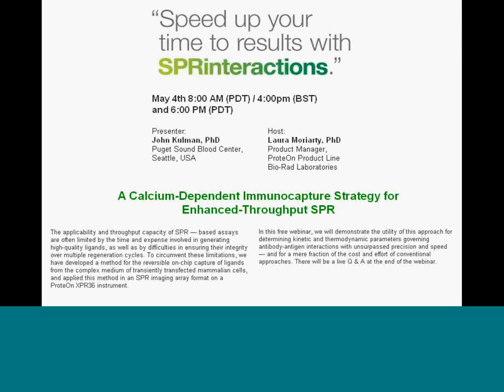So we're very excited to have John as part of our 2010 Become an SPR Expert webinar series, and today he's going to talk about a method that he's developed, which is a calcium-dependent immunocapture strategy for enhanced-throughput SPR. And also John is going to touch upon thermodynamics and give us a little bit of background as well, to give us something to think about for the rest of the day. So with that, I'll pass over to you, John, and we look forward to hearing everything you have to say. Thanks, John. Great. Thank you, Laura.